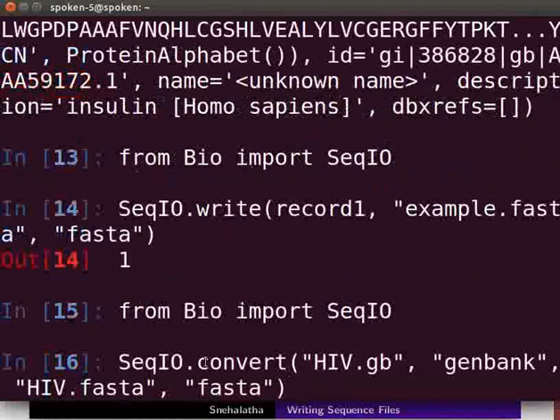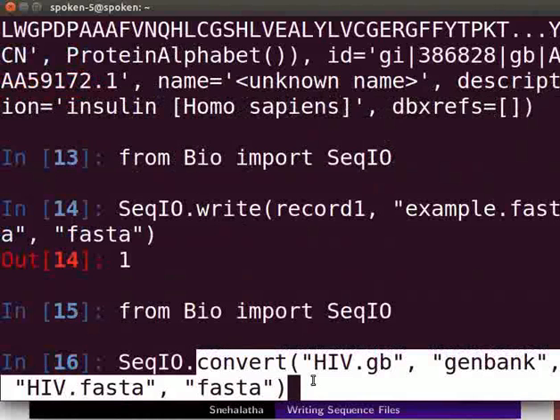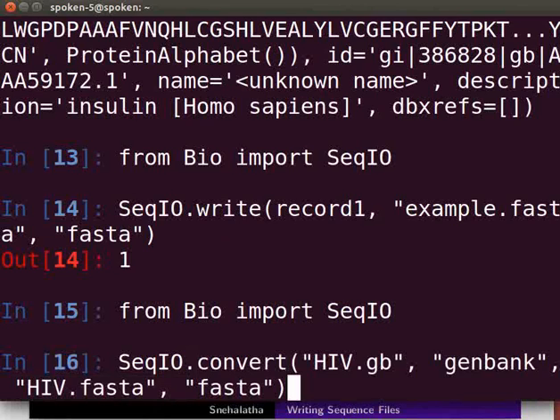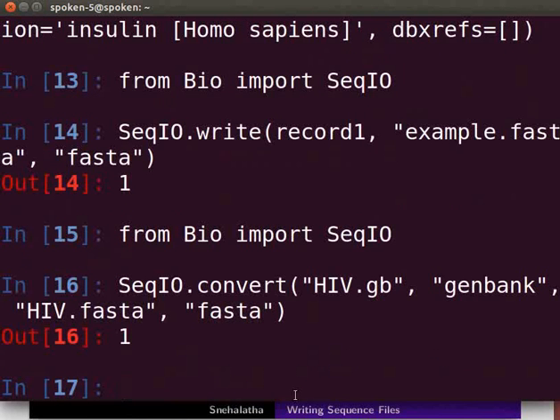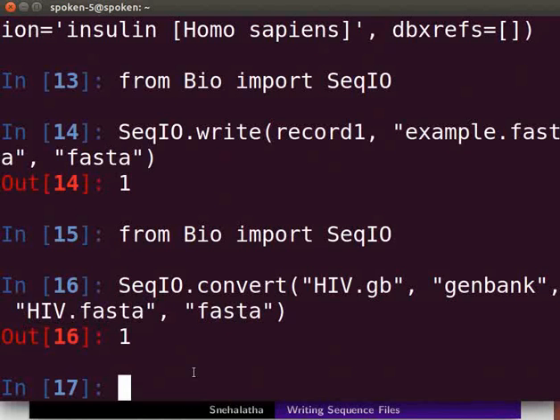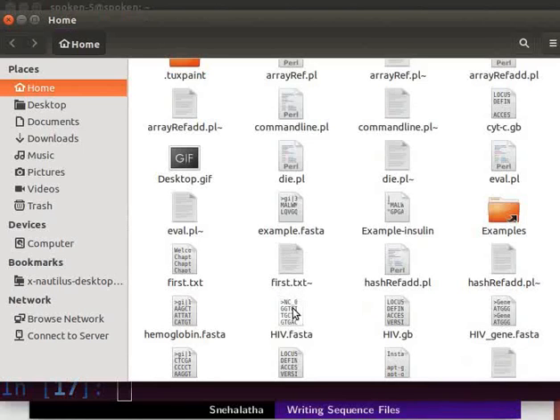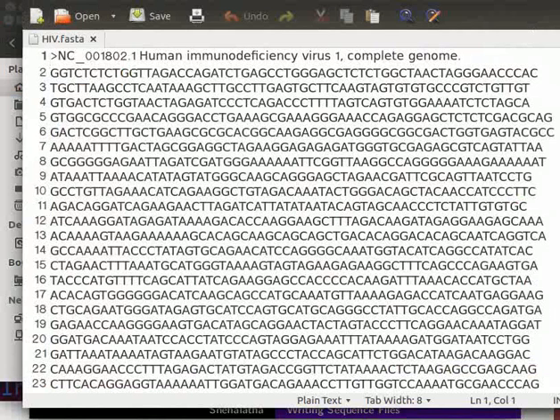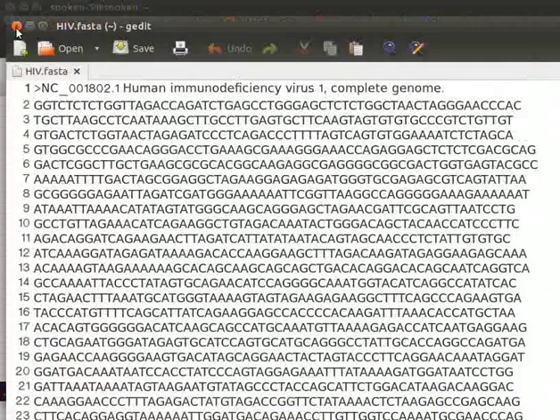Close the text editor. Type the following lines on the terminal. The convert function converts the complete genome sequence present in the GenBank file to a FASTA file. Press Enter. The new file in FASTA format is now saved as hiv.fasta in the home folder. Navigate to the file and open it in a text editor, then close it.